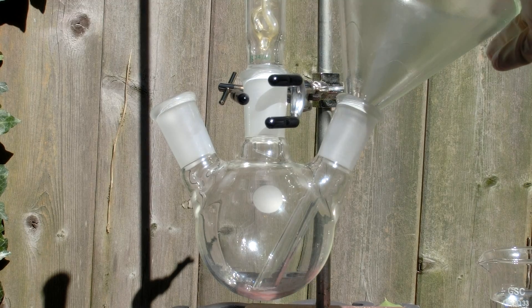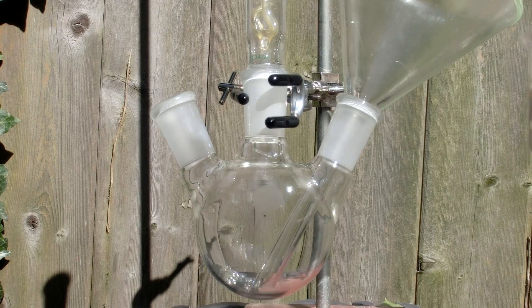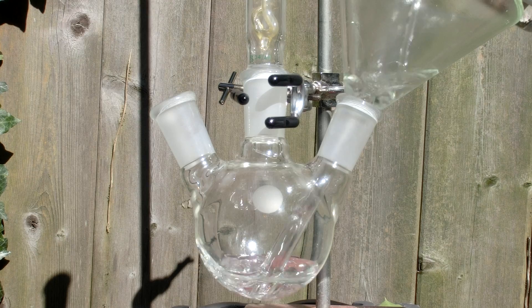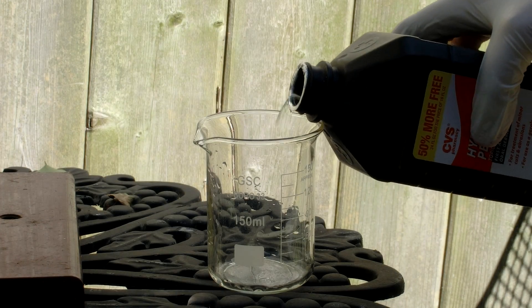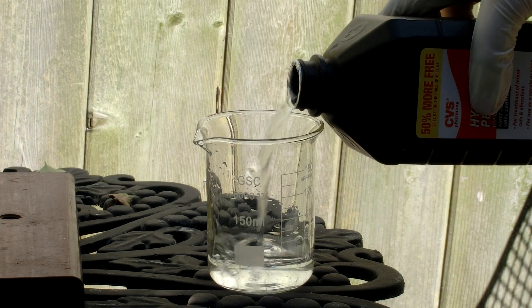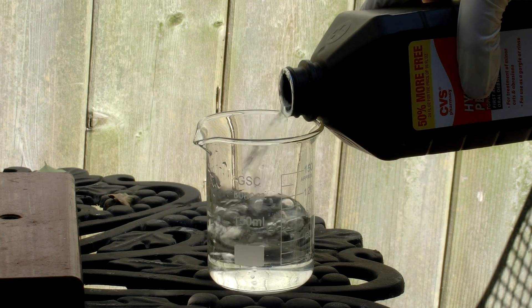Add this mixture to a round-bottom flask. Then measure out 120 milliliters of 3% hydrogen peroxide. Add that to the round-bottom flask.